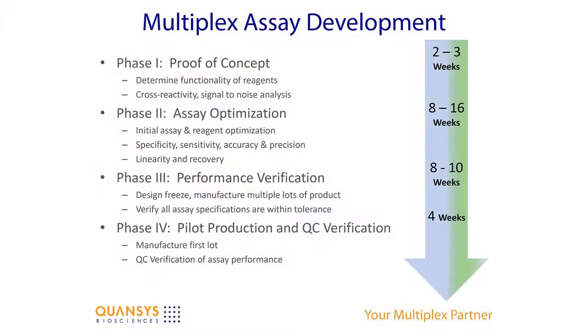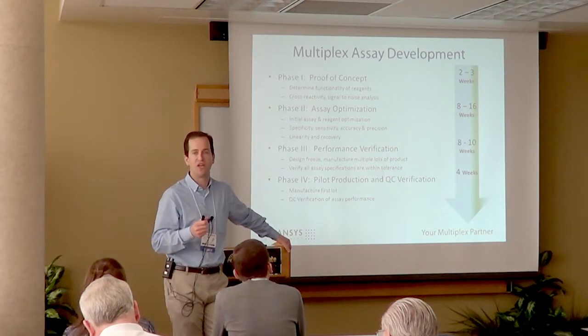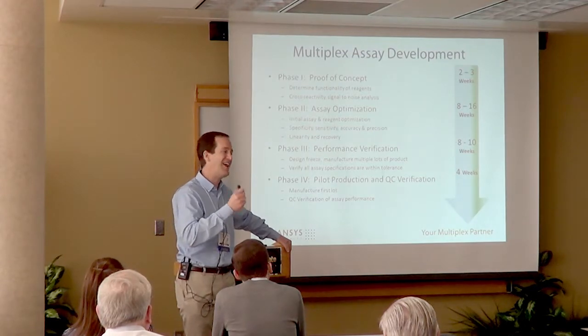And phase 2 is really where the majority of the assay development will take place. In phase 2 is where we are looking at diluents, at printing conditions, at assay conditions, to really put the screws to this assay to see if it's going to meet the specifications that are required for this assay to be effective in your application.